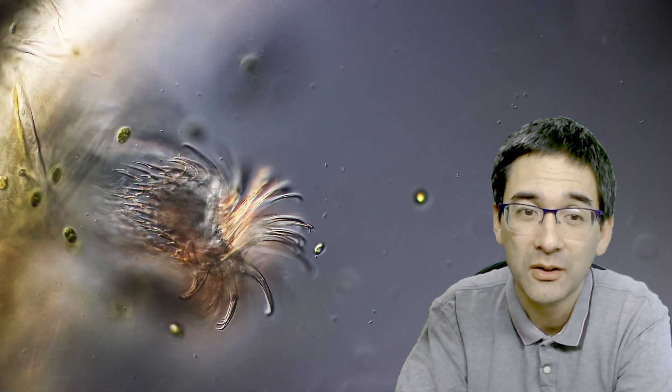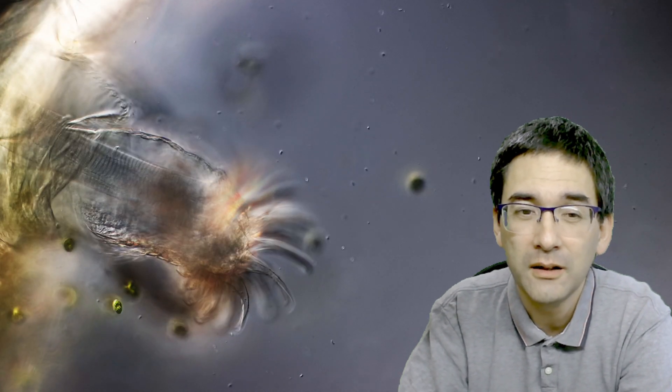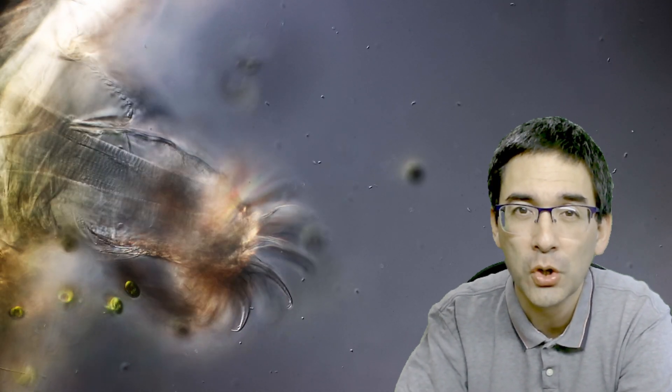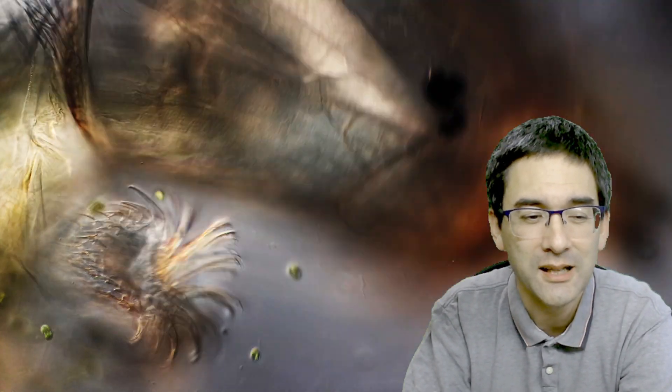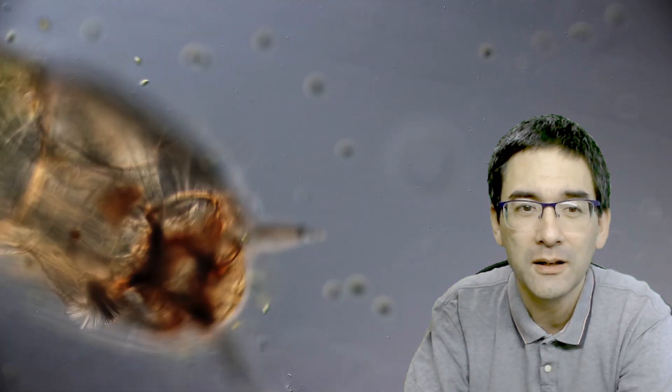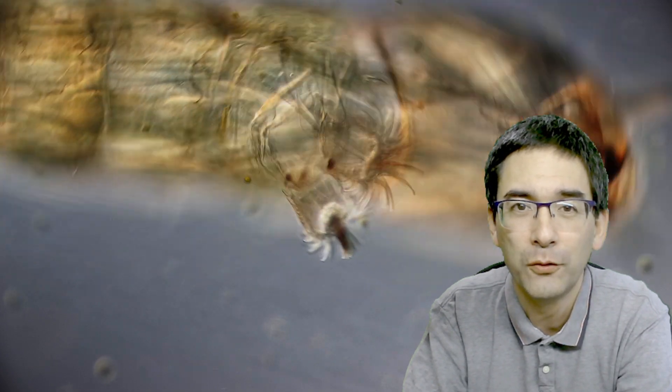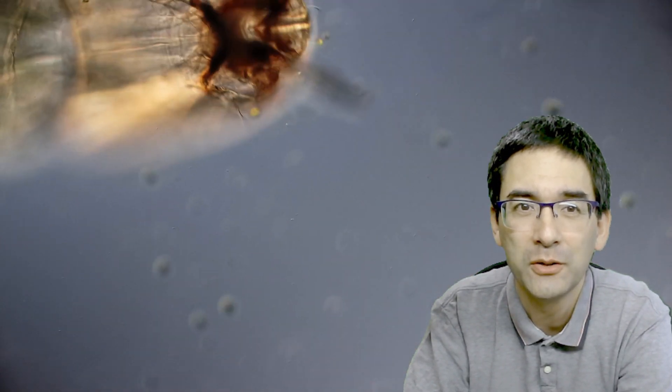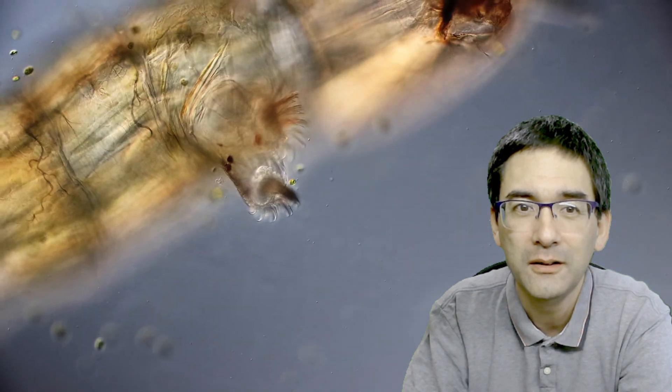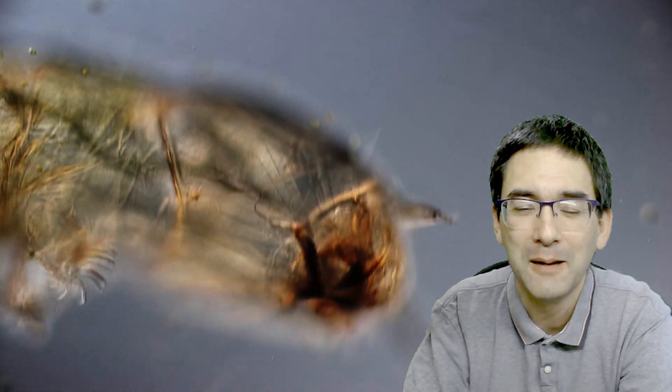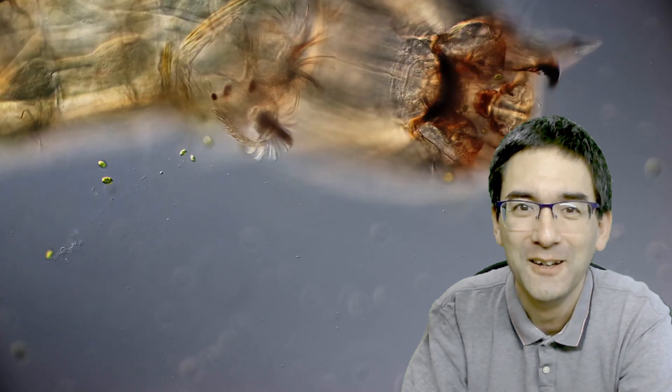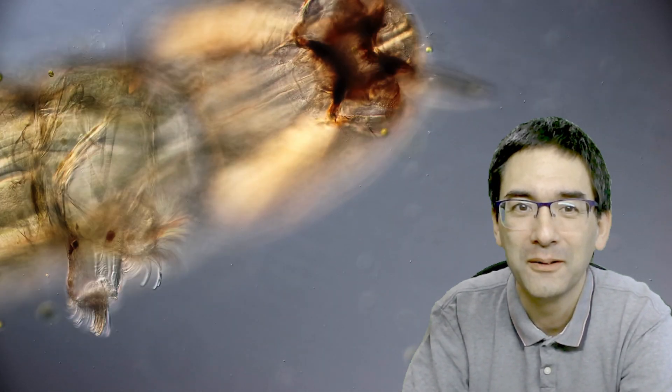Here we see quite nicely again those tiny little hairs. Yeah, it looks like they have tiny hooks on them, but really there's nothing to cling to on a smooth glass slide. So basically I observed the midge now for a couple of minutes. Here we can also see how it pushes itself along. I think it's doing this quite effectively, and also at the same time, look at the mouth parts trying to gather food.